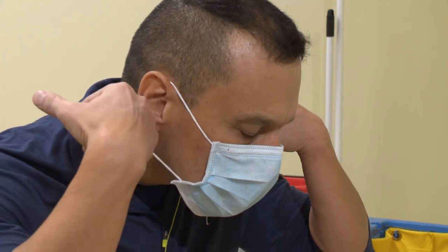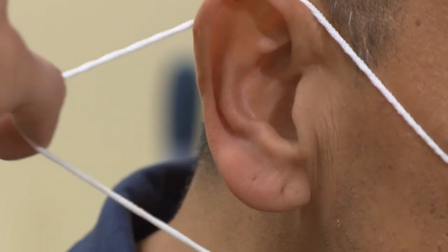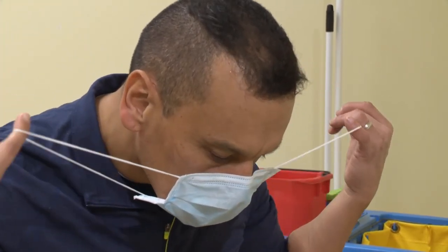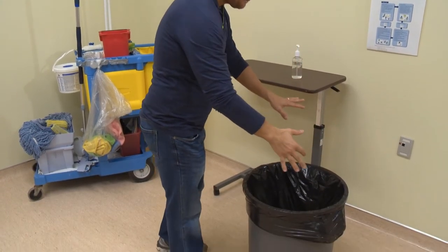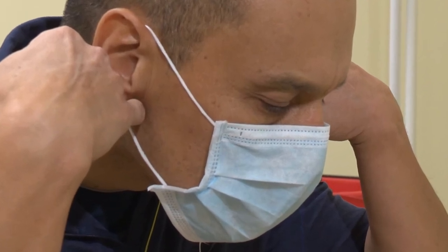Now, remove your mask by using your pinky fingers to grasp the loops from behind your ears. Lean forward from the waist and allow your mask to fall away from your face into the waste container. Avoid touching the front of the mask to prevent contaminating yourself.